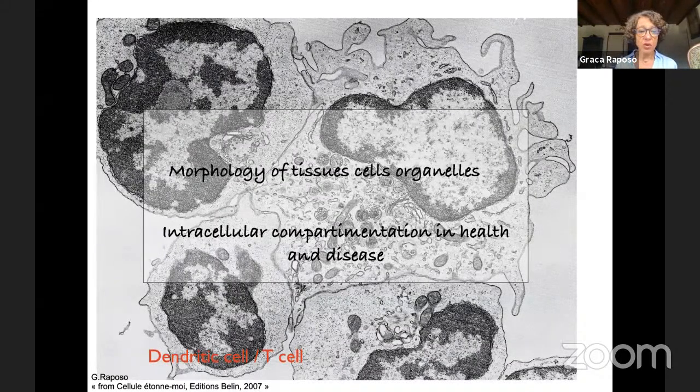have even biopsies of a patient that have maybe metastasis of a melanoma into the liver. Now it's always difficult, of course, when we are working close to the hospital. And of course, this is a method that we can do. We can take these biopsies and we can look, and we can use these very basic methods for many purposes.